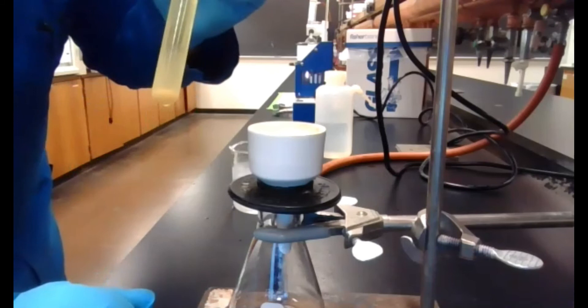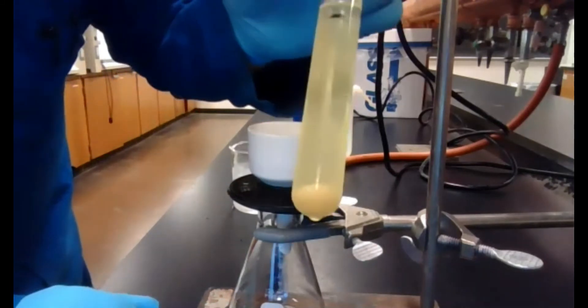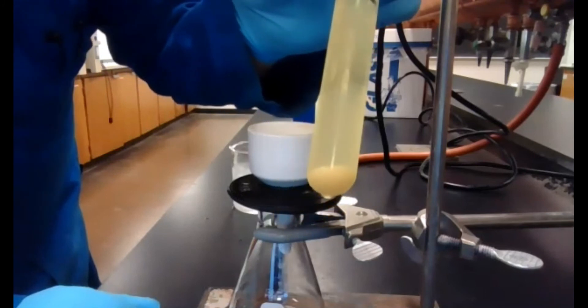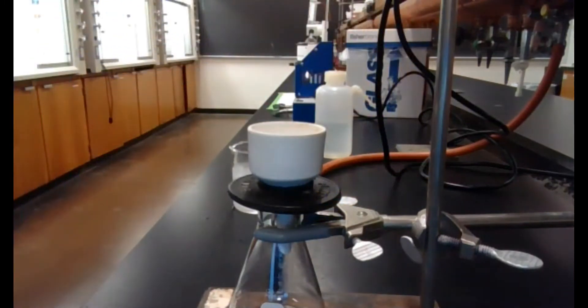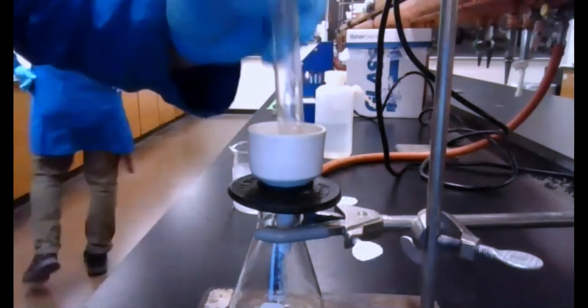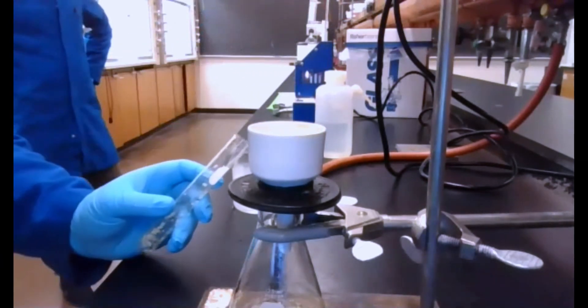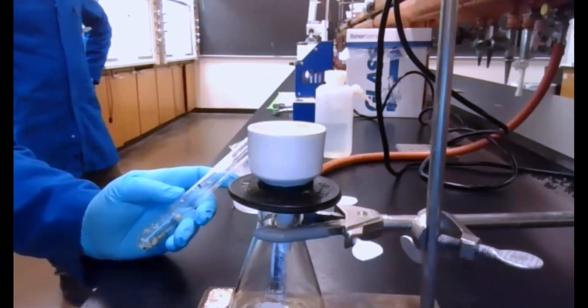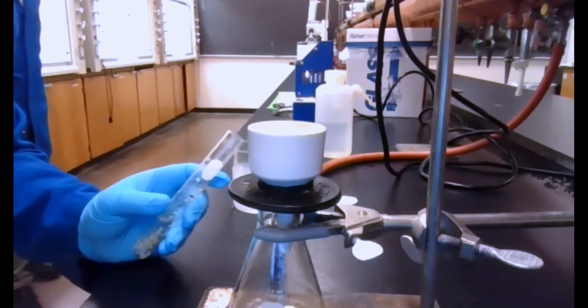All right, we've gone ahead and cooled our recrystallization down. You can see more has kind of crystallized out and fallen to the bottom. So now we're going to go ahead and filter that, trying to get out as much as possible. Once this is dry, we're going to get a melt temp and an IR and a UV-VIS and we'll post it on canvas.